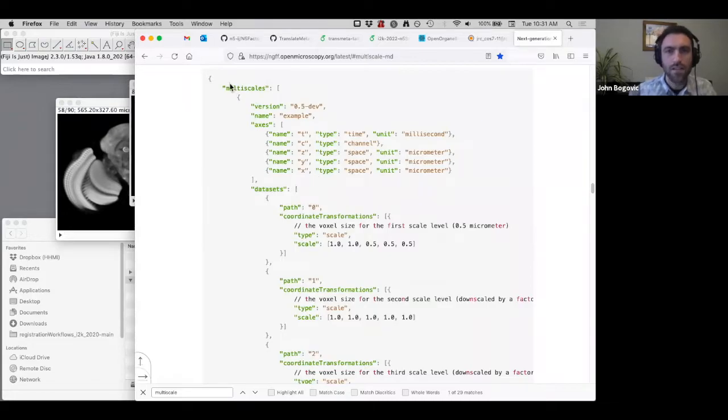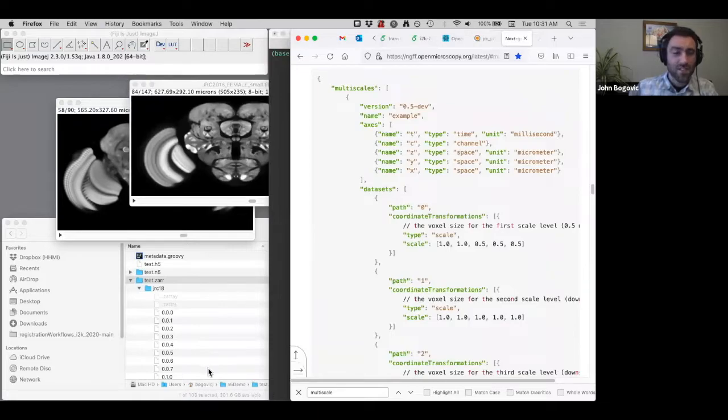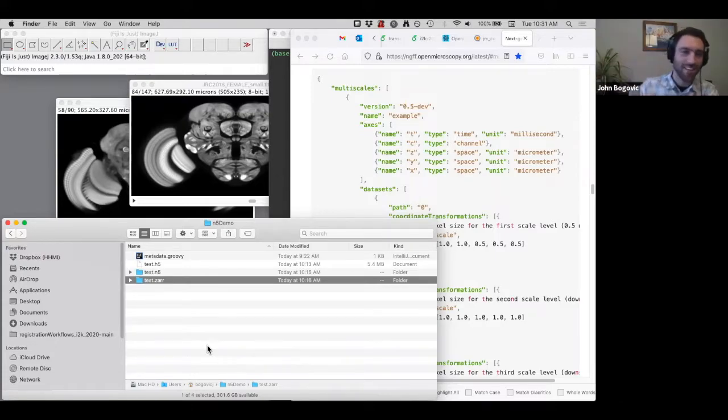And yes, thanks, Mark. Okay. This is great. I like conversation. So any other questions now? I think one thing I discussed with Davis is whether some of this metadata belongs to the data set or potentially to the group that it's in. I think that's maybe one discrepancy between NGFF and Open Organelle. But I think that's resolvable at some point. Yeah, there's ongoing conversations about that in GitHub issues.